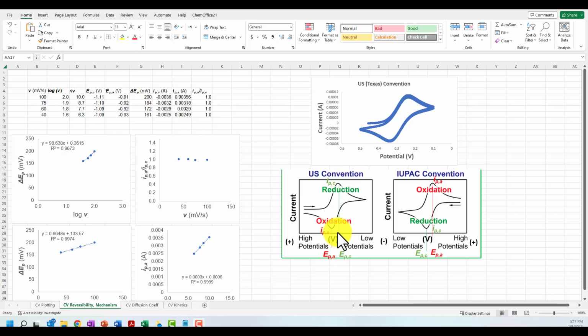And similarly on the other side, in the oxidation side, and negative currents, similar to this, we would call that IPA for the anodic peak current. And the voltage, or the potential at which those peak currents occur, get corresponding names. E, which is the typical symbol for potential, peak for the anodic current, and E peak for the cathodic current. So I have lines sort of roughly drawn where those intersect the x-axis, which is our potential curve.